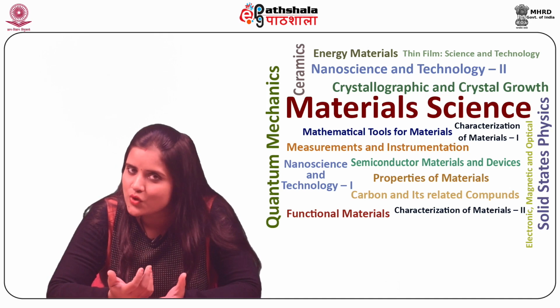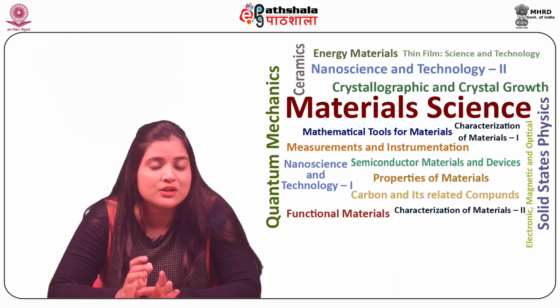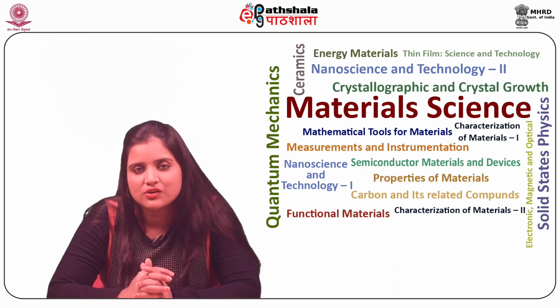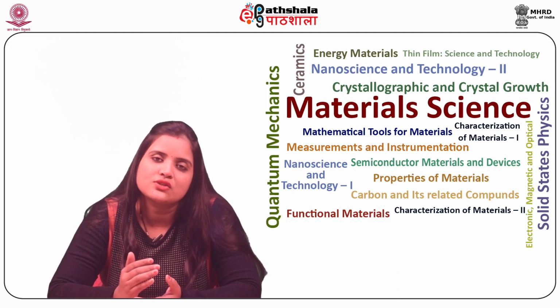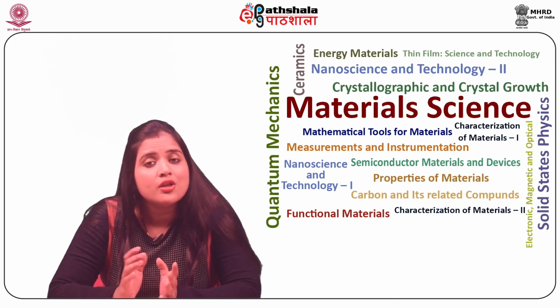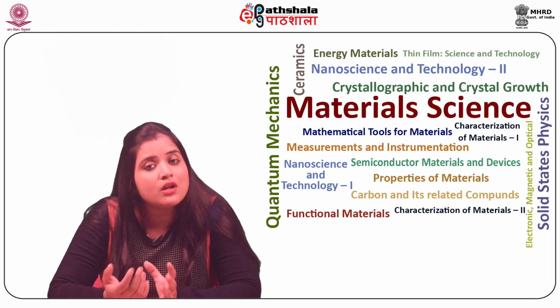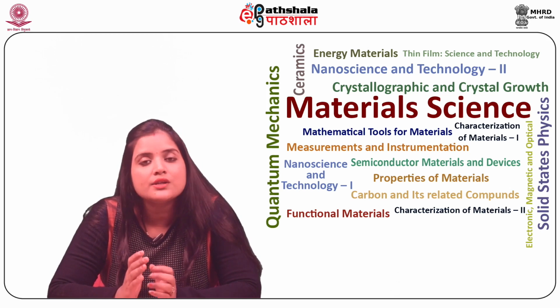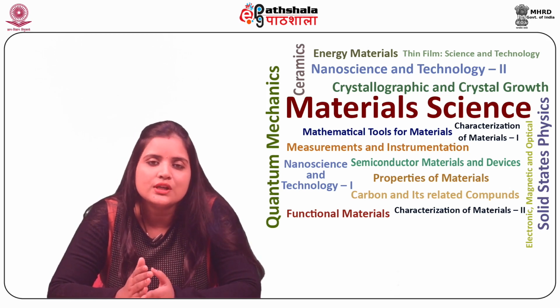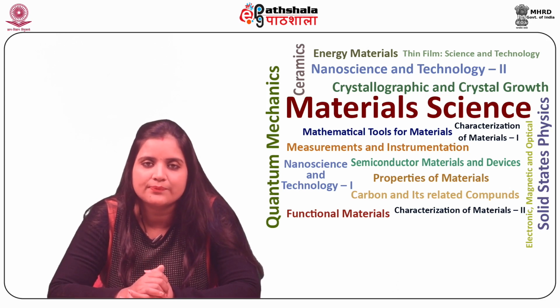Coming on to disadvantages of SPM, firstly, the tip selection is highly challenging. Then, the scan process is time consuming. Another disadvantage is that smaller images are produced. Also, it is not suitable to study solid-solid or liquid-liquid interfaces.